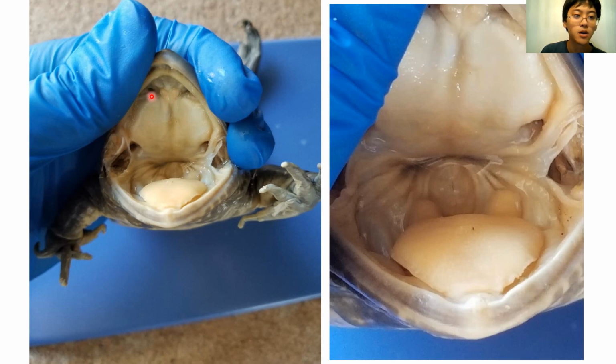These holes here, those are the nares. Those are essentially nostrils. They lead from the nostrils into the mouth. I guess this is a good time to talk about the respiration. So they have the cutaneous respiration, which is the main form of respiration. They also have buccopharyngeal respiration, which uses the membranes in the mouth and the pharynx to respirate. Basically, they draw air into the mouth, and then it transfers oxygen there. And then they actually do have pulmonary respiration, but it's not what they rely on, so it's not particularly advanced.